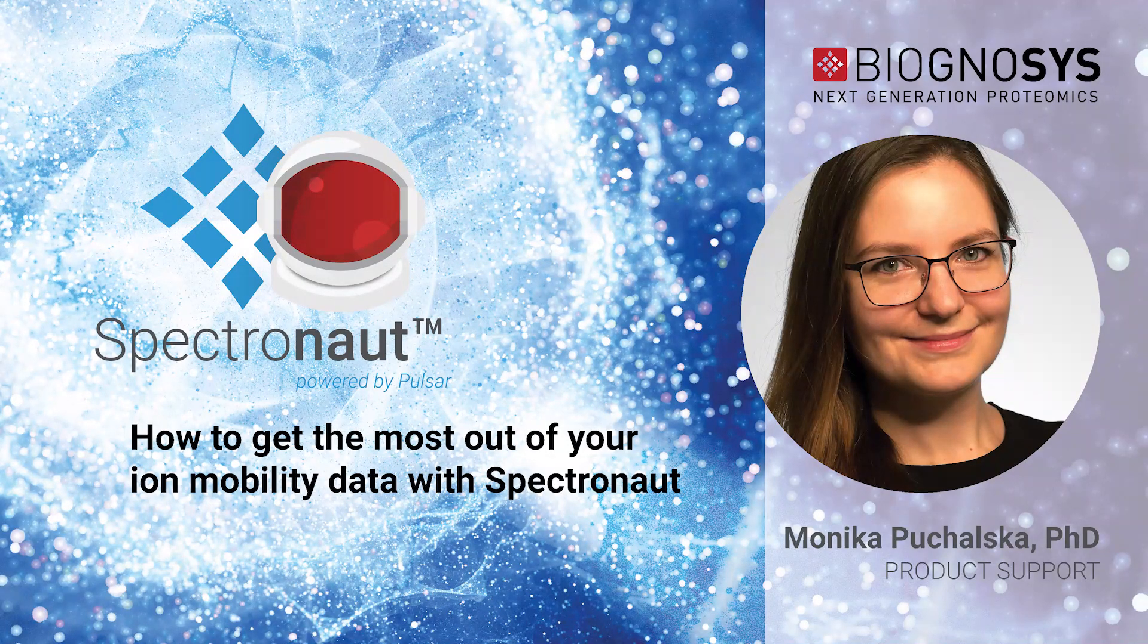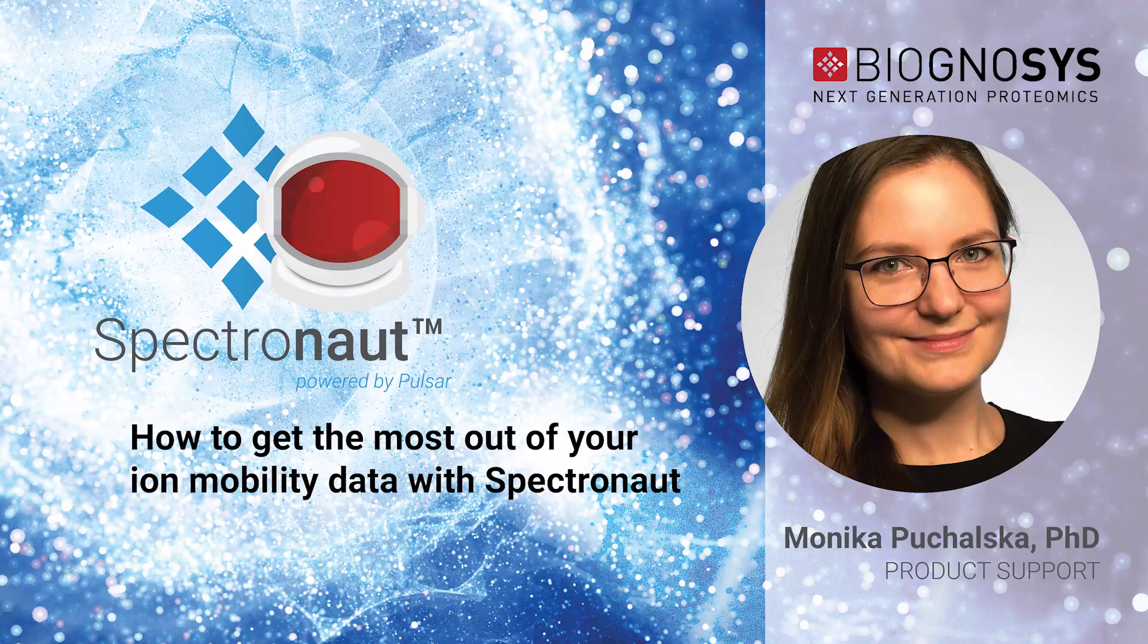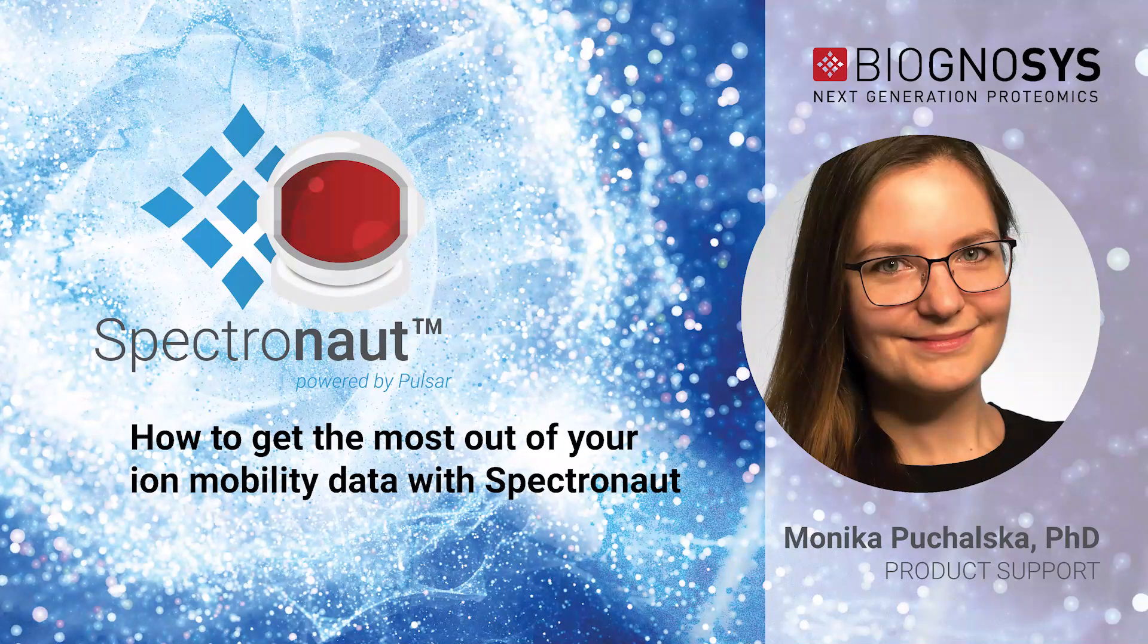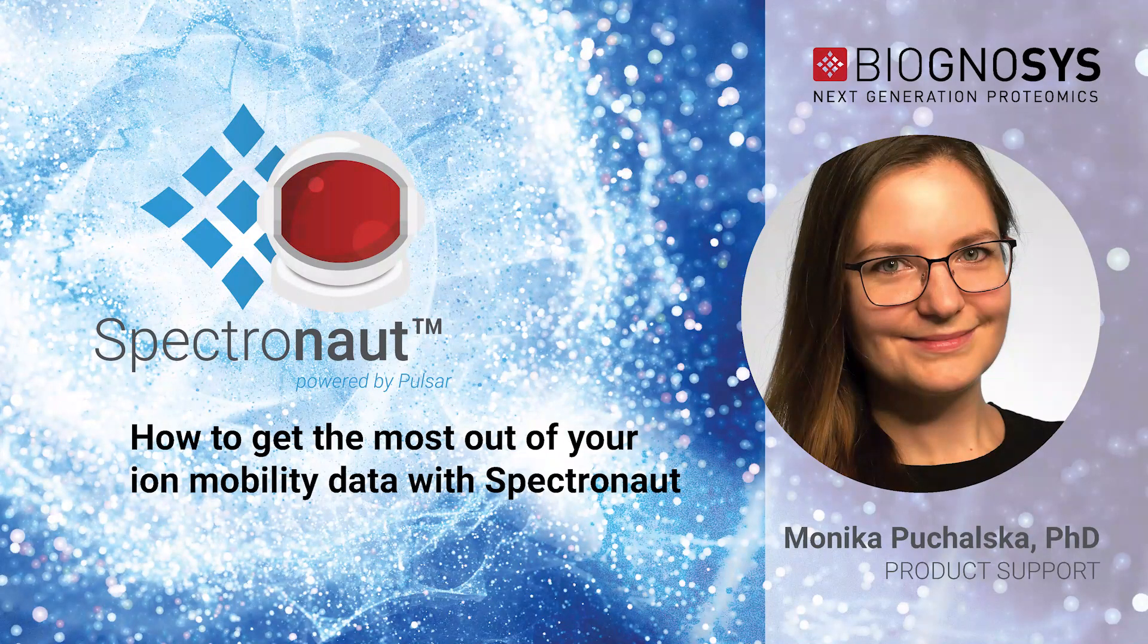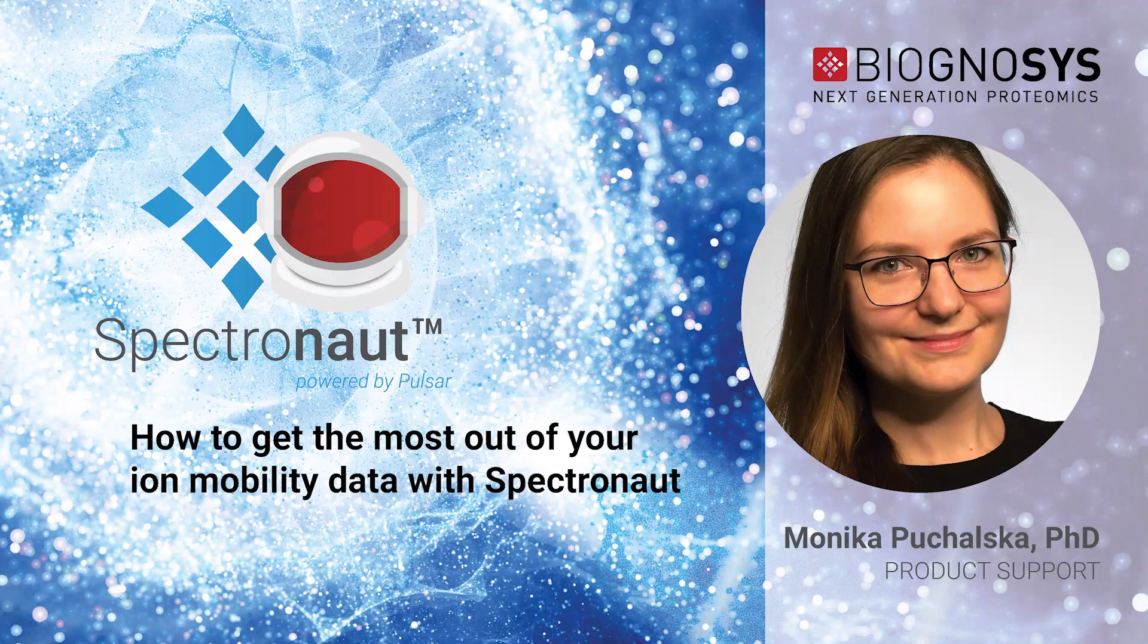As well as Thermo FAIMS Pro, where ion mobility is used as a filter with single or multiple compensation voltage values.